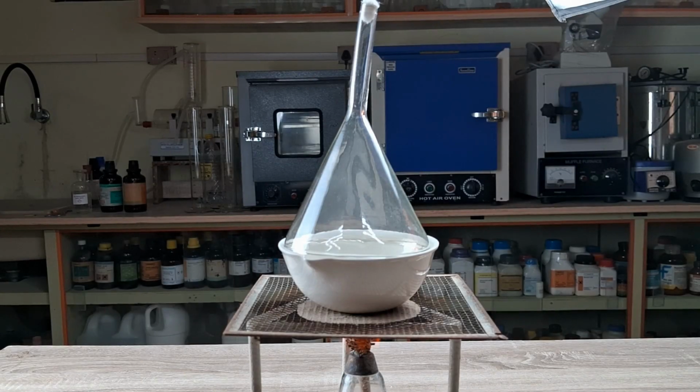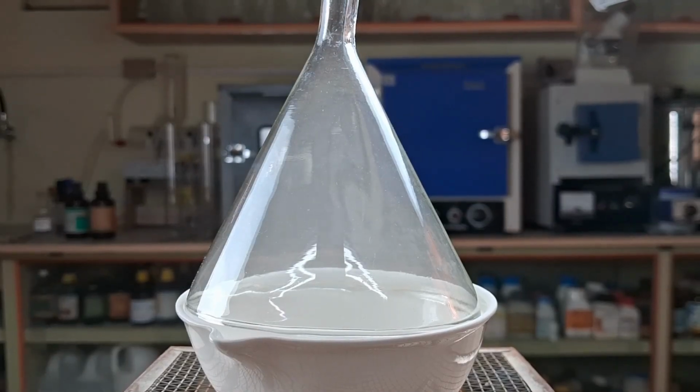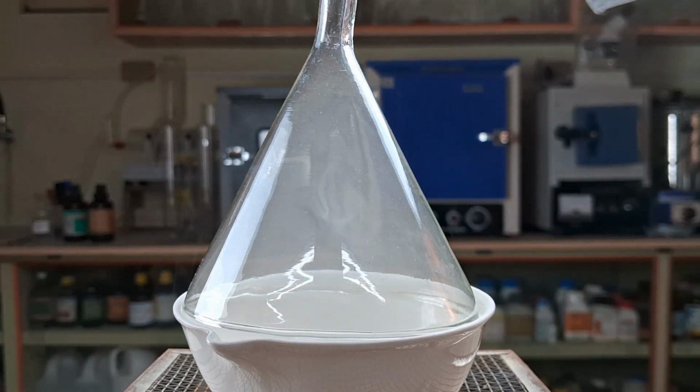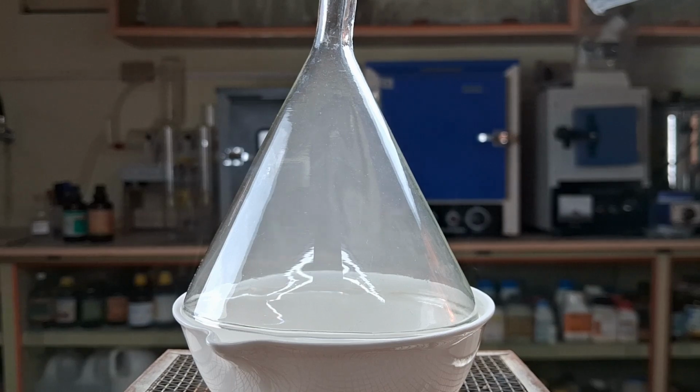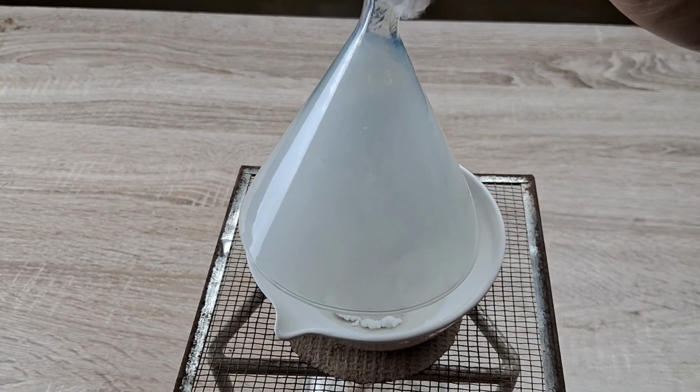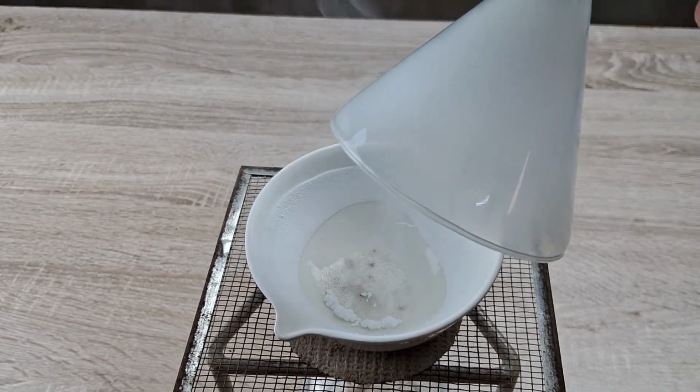After a couple of minutes of heating the ammonium chloride, you will observe copious amounts of white fumes begin to form and occupy the inside of the funnel. The salt also begins to disappear slowly and turn into a gaseous phase.